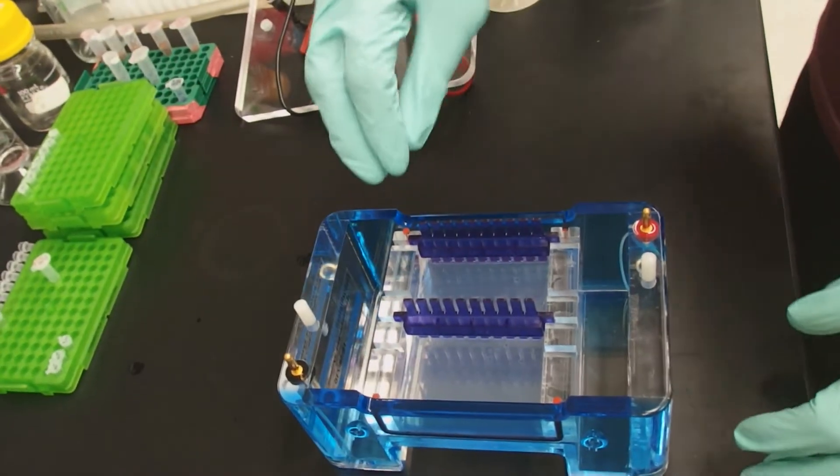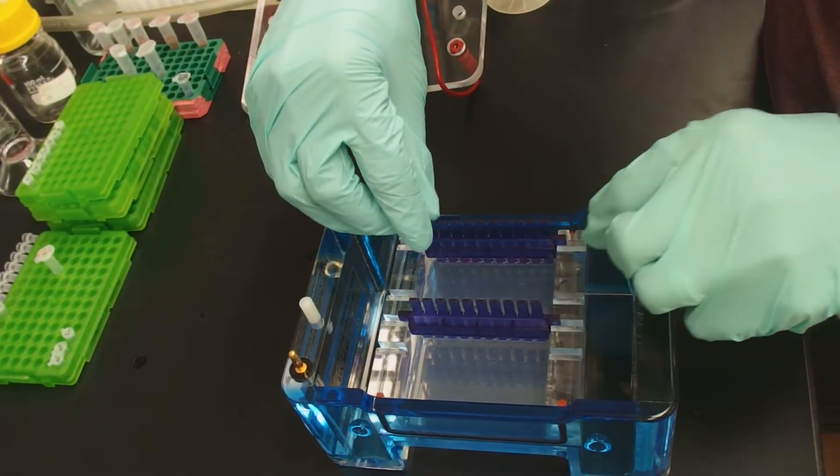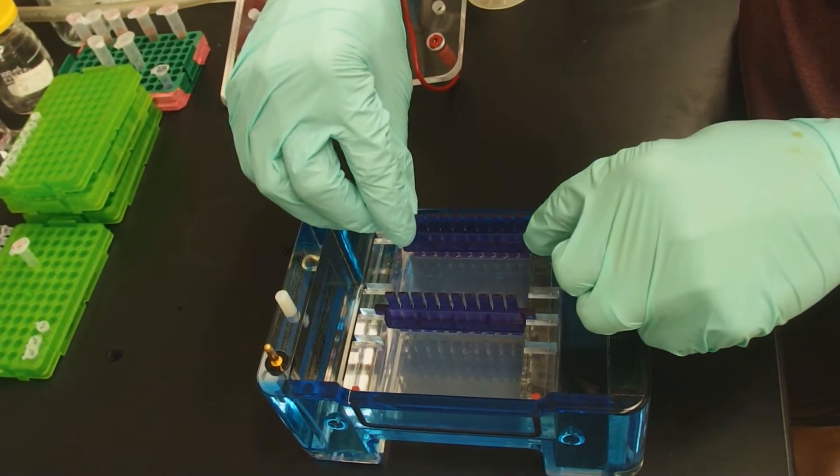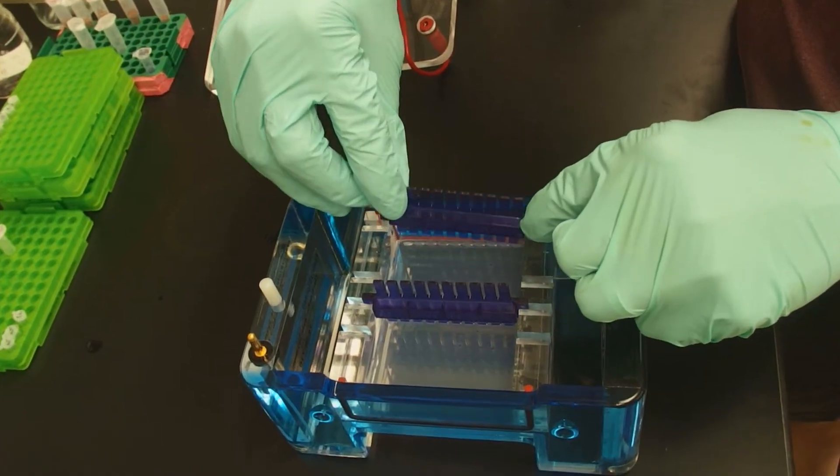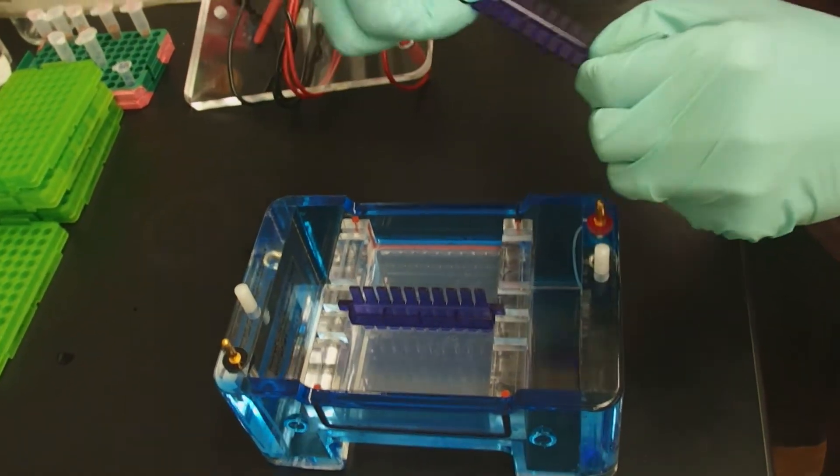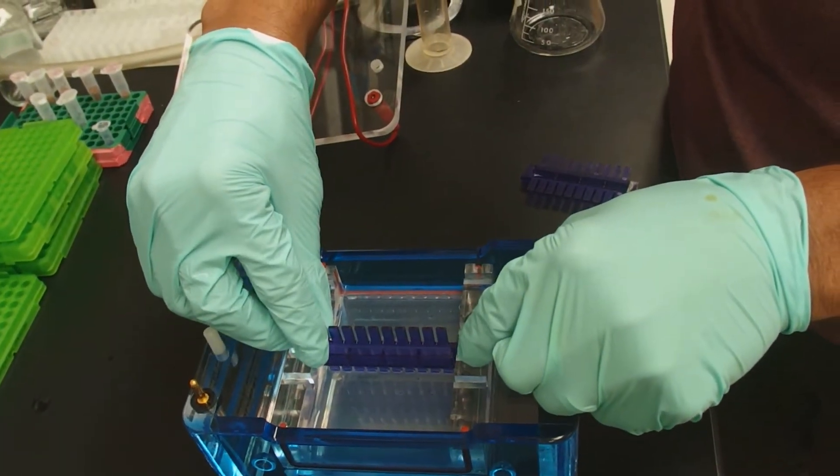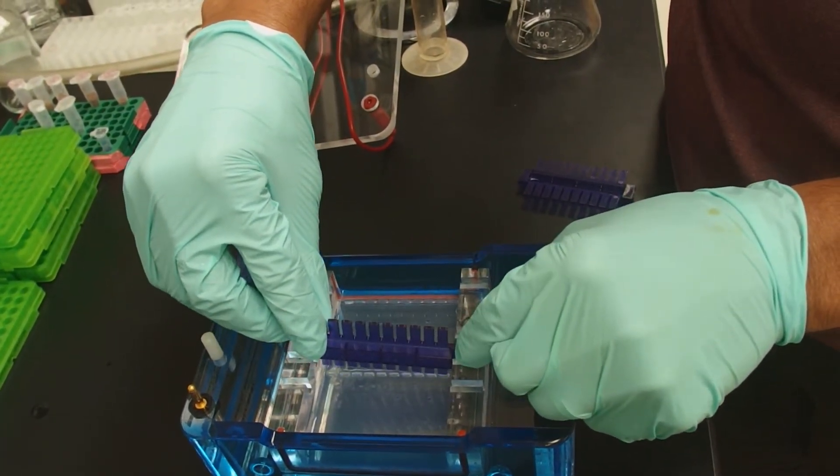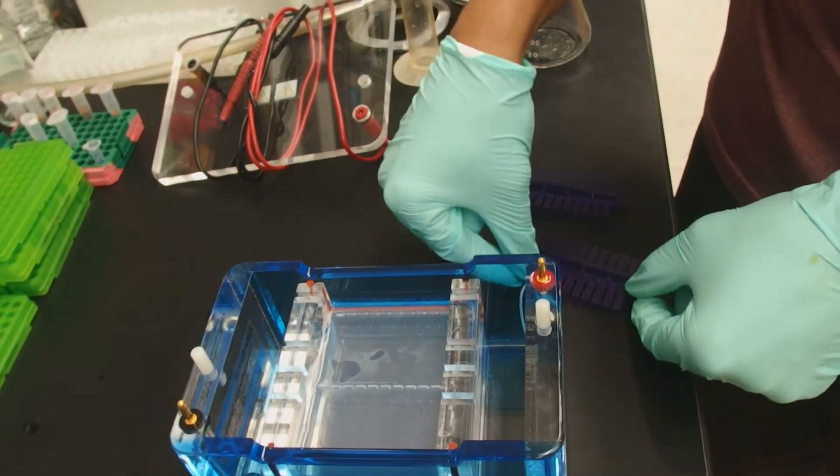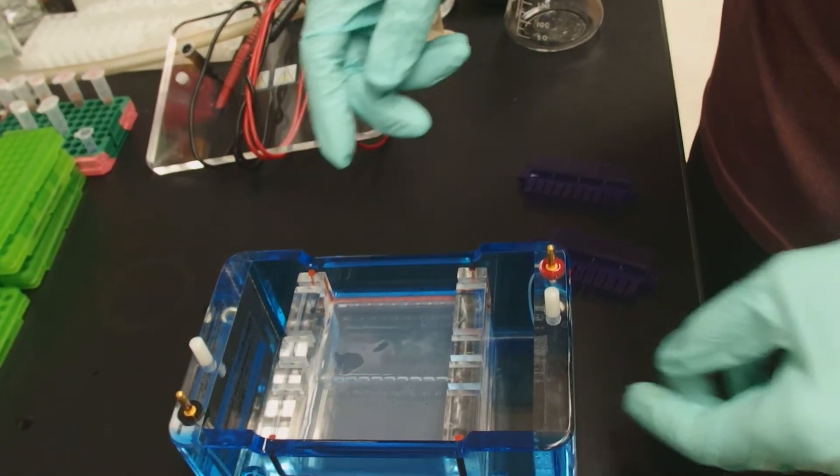We need to take our combs out, and the way we're going to do this is we're going to start on one end and raise it sort of like a drawbridge, so one end gets pulled out first. And you do this slowly and carefully. When you do it slowly like that, you won't tear the wells.